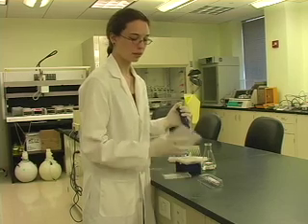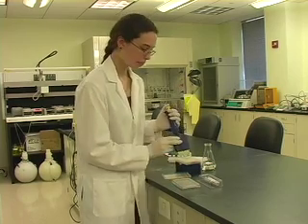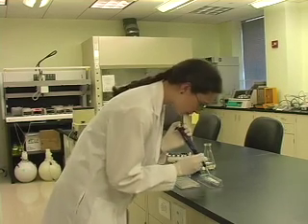ELISAs are run in 96-well plates. A multi-channel pipette can be used to load multiple wells at a time. Coat a 96-well plate with the capture antibody diluted in coating buffer or PBS. Incubate the plate for the time specified by the instructor.